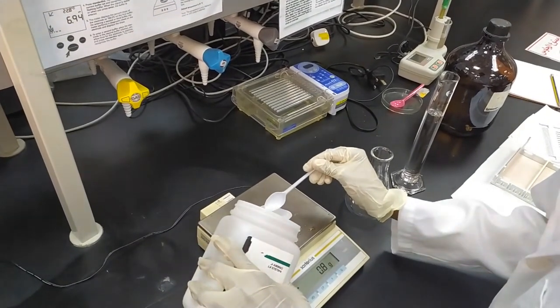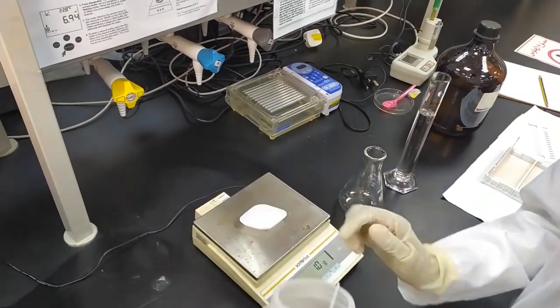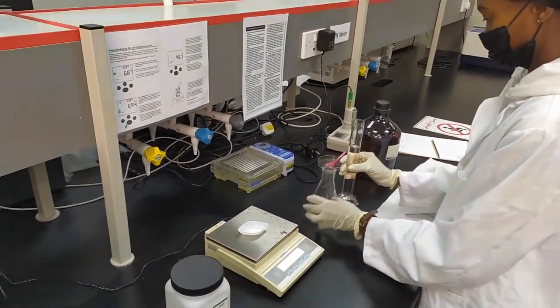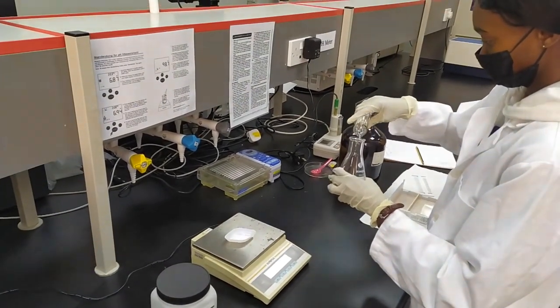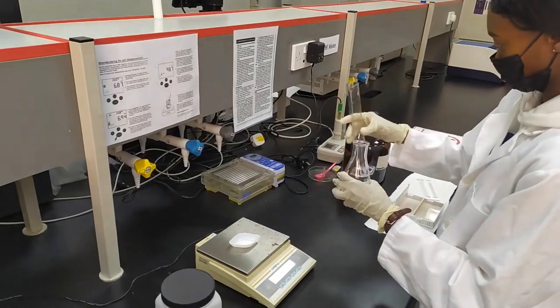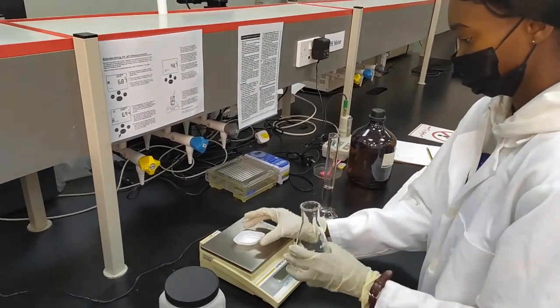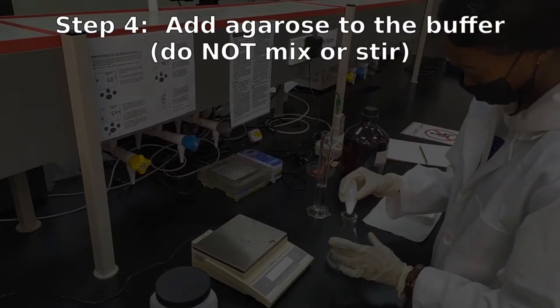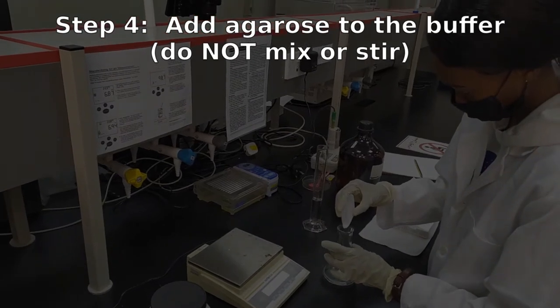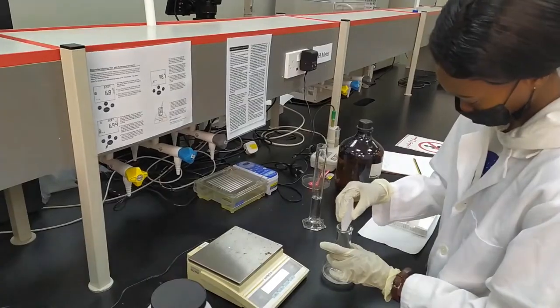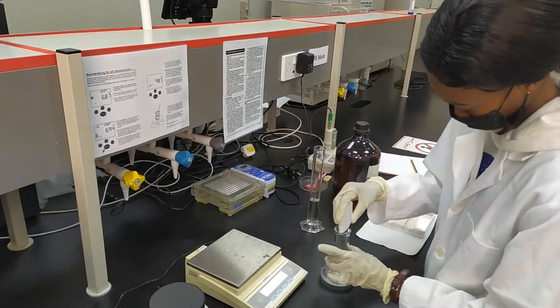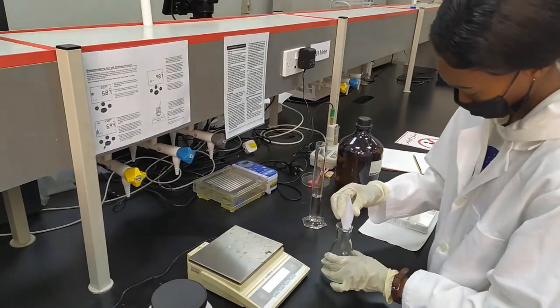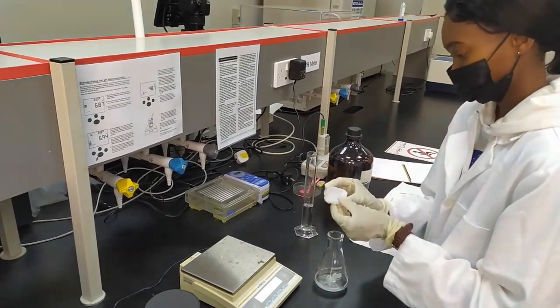Now, once you have the reagent weighed out, you're going to transfer that into a flask. In general, you want to start off with a little bit of the solvent inside the flask whenever you're making any solution. And then, you're going to add your reagent, so in this case, the agarose. Now, agarose does not dissolve at room temperature, so it's going to stay in powdered form. And you'll notice that cognac has actually saved a little bit of the buffer pour after adding the agarose. This way, she can wash down the sides of the flask to make sure that all the agarose goes to the bottom.